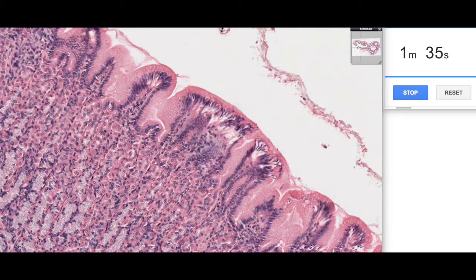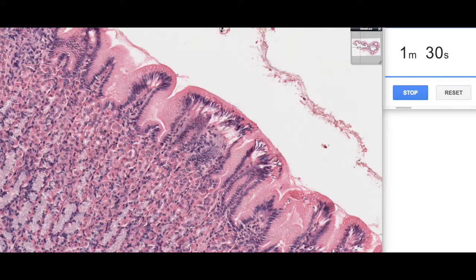If we zoom in, what we can see is this surface simple columnar epithelium, and these are lined by what are called surface mucus cells. They secrete a protective mucus, some of which you can actually see here.